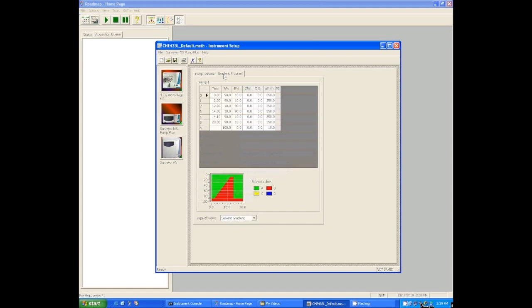And you can see at two minutes, we're still at 90 percent A, 10 percent B. So in that way, we've programmed a hold. There's a two-minute hold at 90 percent A at the beginning.